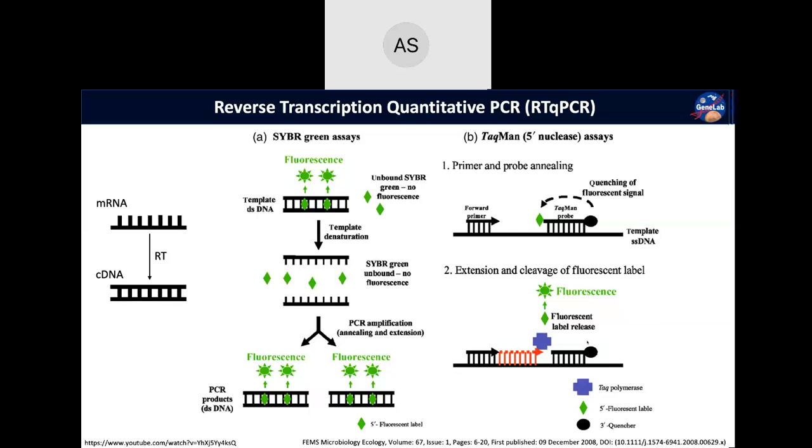So as these cycles move on, that fluorescent signal will become stronger in our flight samples before it becomes stronger in our ground control samples. So then we can do a comparative analysis between our flight and ground control to see, okay, when did we reach a certain point of brightness in these cycles, and whichever sample reaches a brighter point sooner, that means that there was more of that gene of interest to start with.